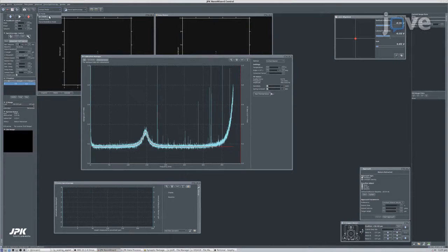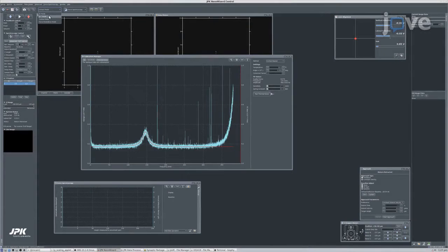After having calibrated the cantilever, in the software, ensure that the system is in QI mode and approach the sample with a set point force of 50 nN. Next, set a Z length of 4 microns and set the scan area to 80 by 80 microns squared with a number of pixels set to 40 by 40.